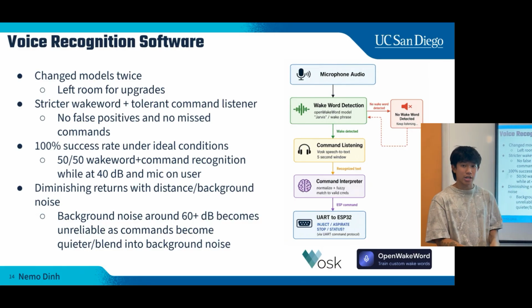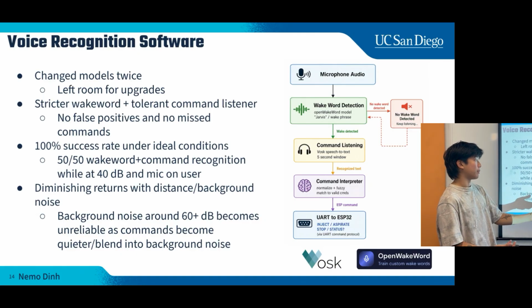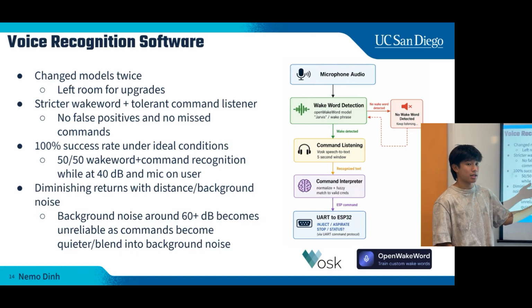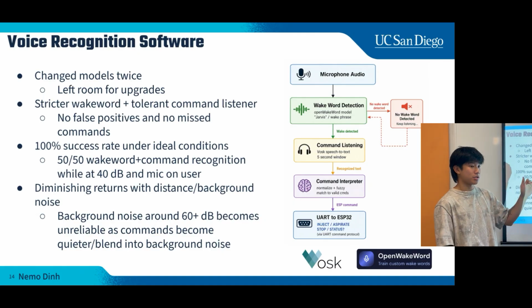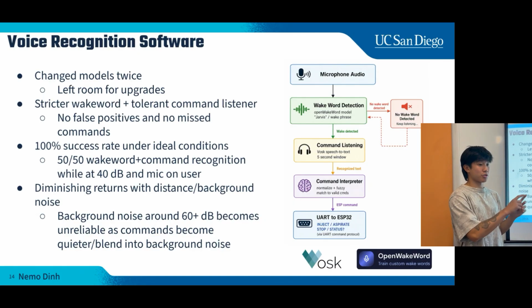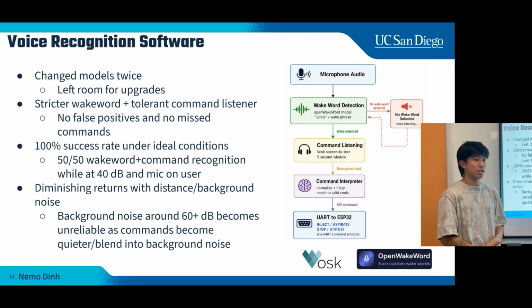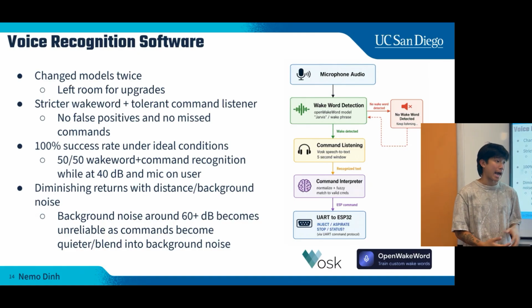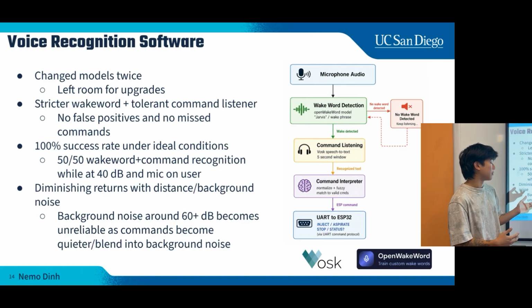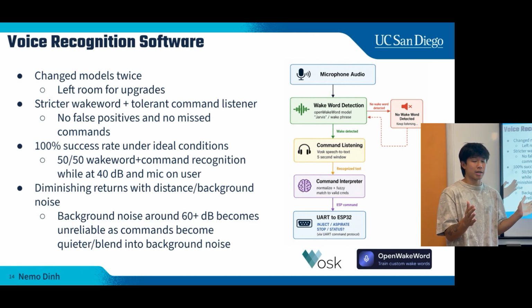These commands are like inject, aspirate, stop. It has a 5-second window to find that command. If it hears that command, it then parses it into a string that the Pi sends over to the ESP, and that's how the motion happens. Under ideal conditions, we've had 100% success rates for the wake word plus command recognition, so the full voice recognition pipeline.